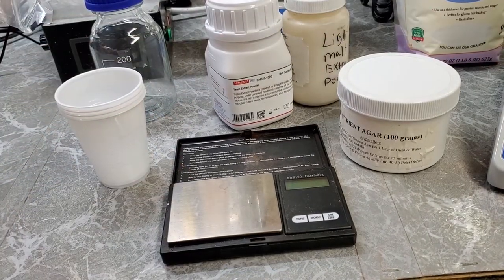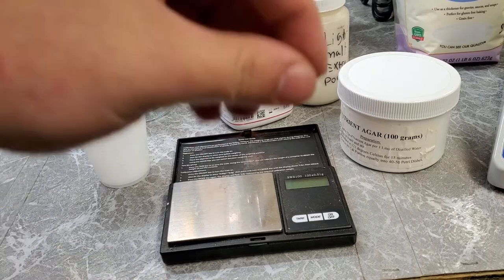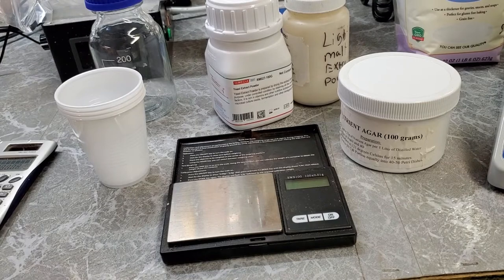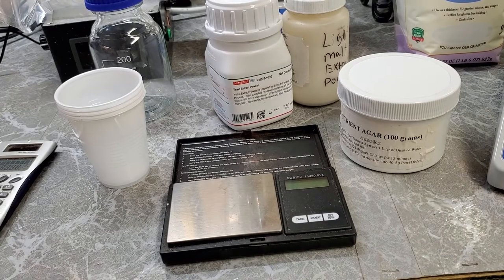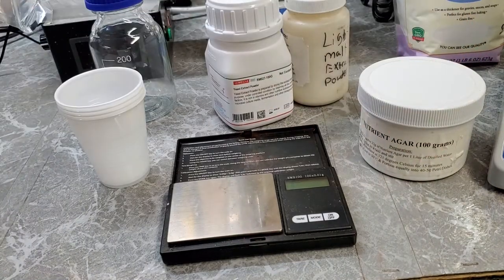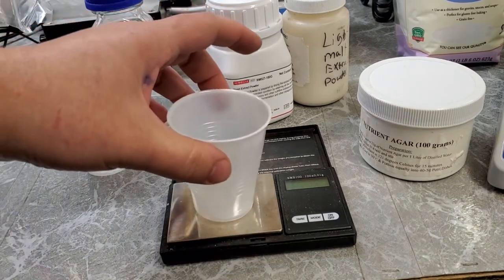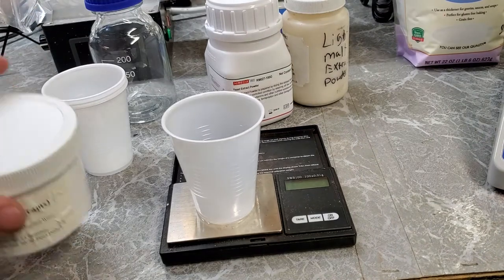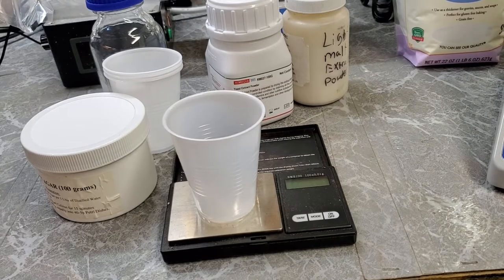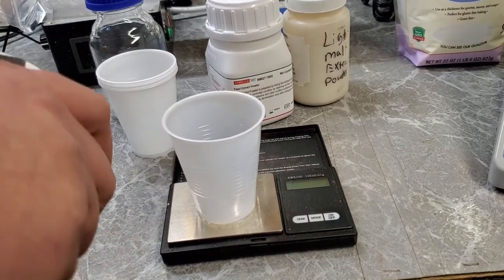We're going with 400 milliliters of water. I'm going to round the concentration up to 0.025 grams per milliliter. So 400 milliliters times 0.025 gives me 10 grams of agar powder needed. That will also ensure that the agar present in the petri dishes is a little thicker, and once it sets up it'll be harder and easier to do transfers by cutting out chunks.